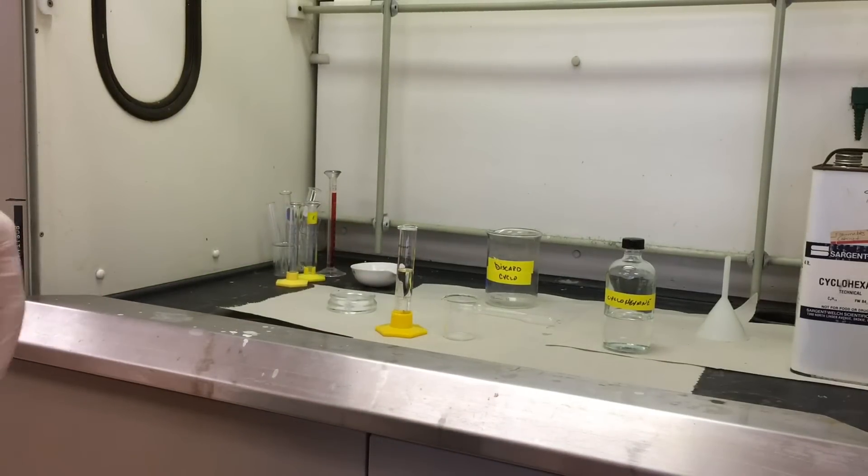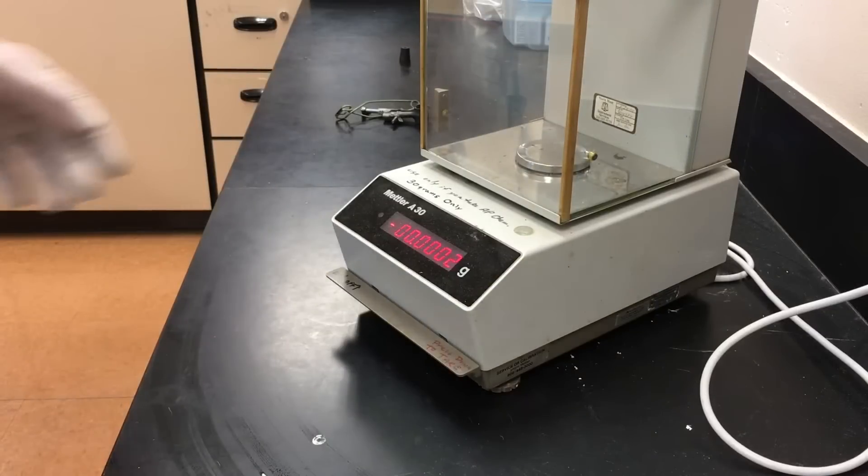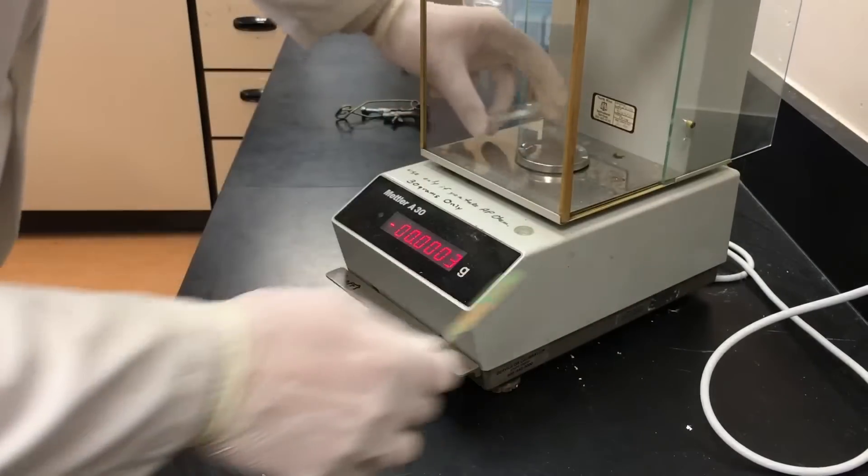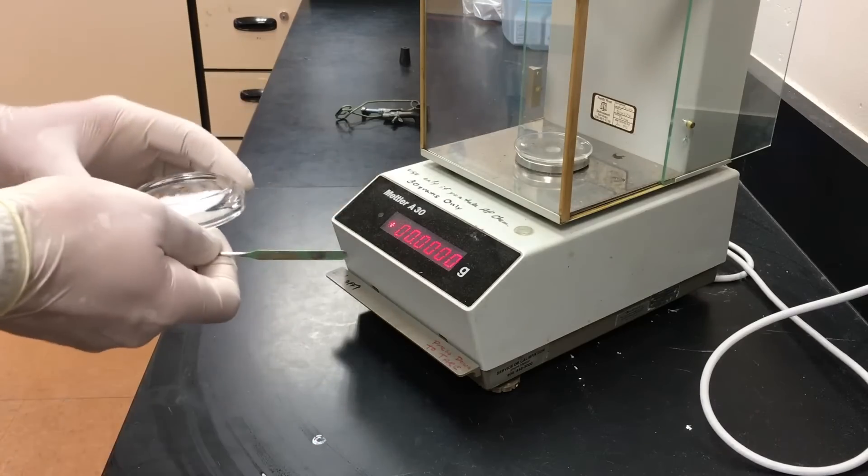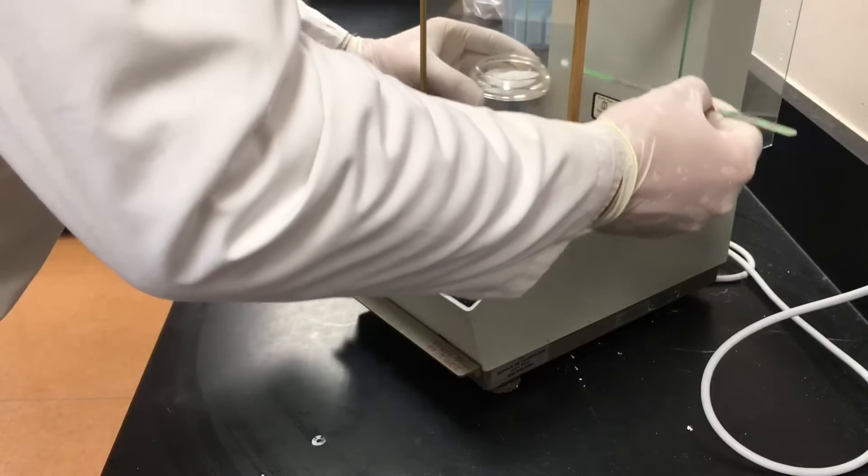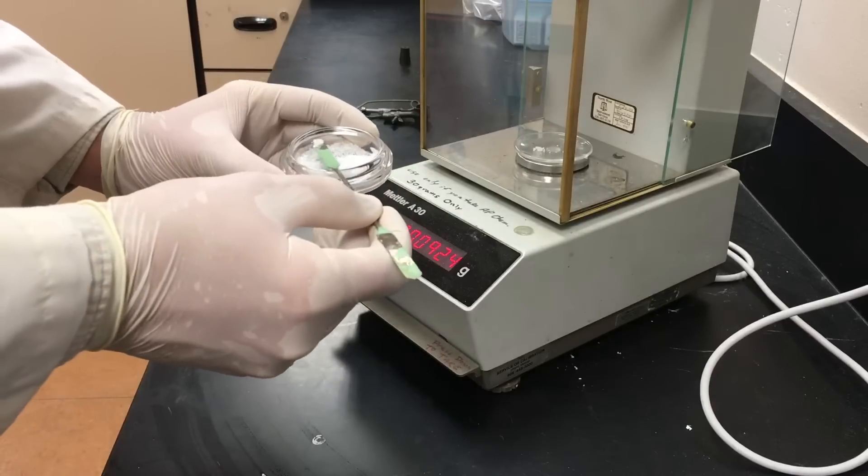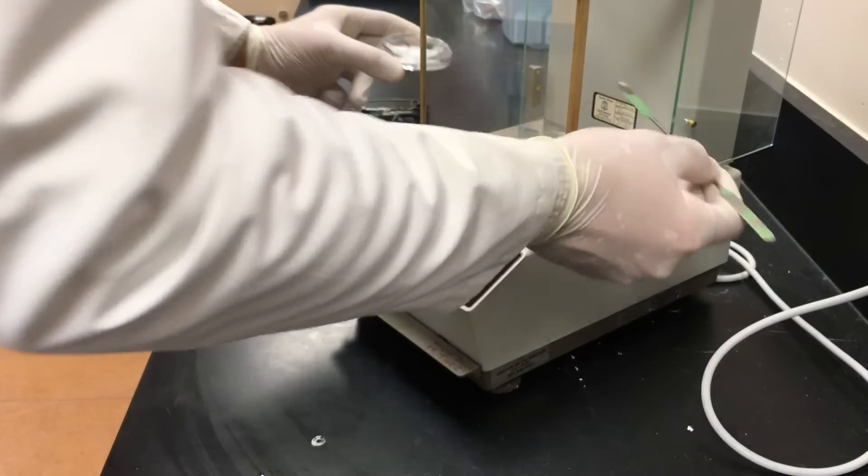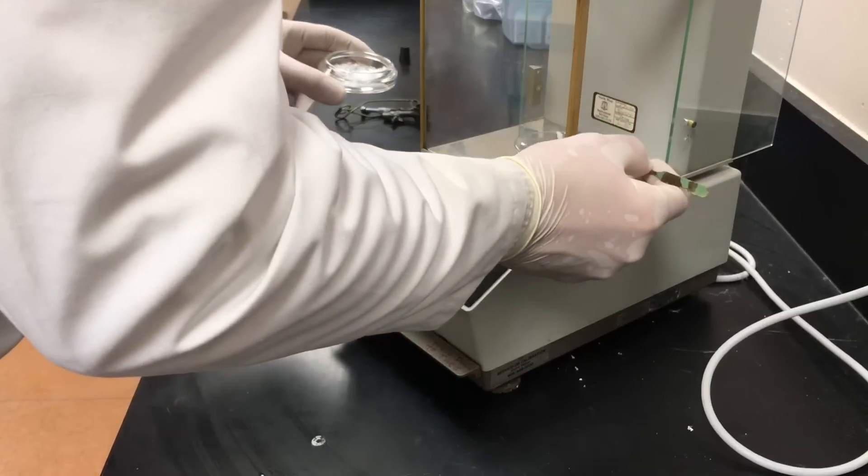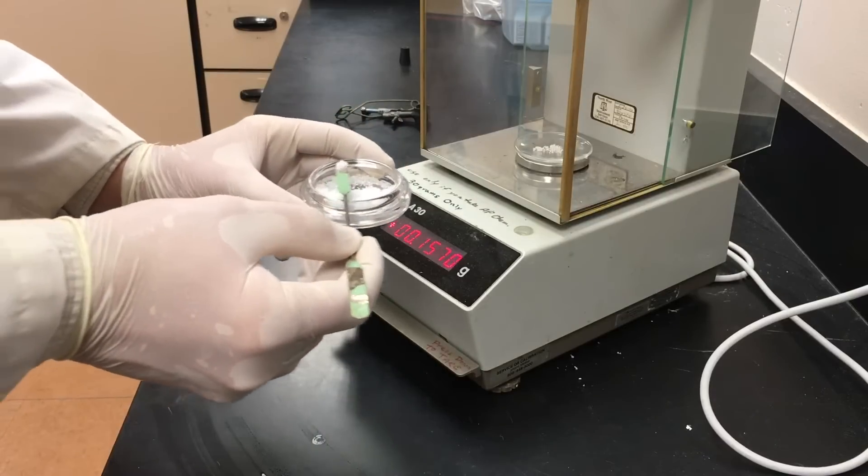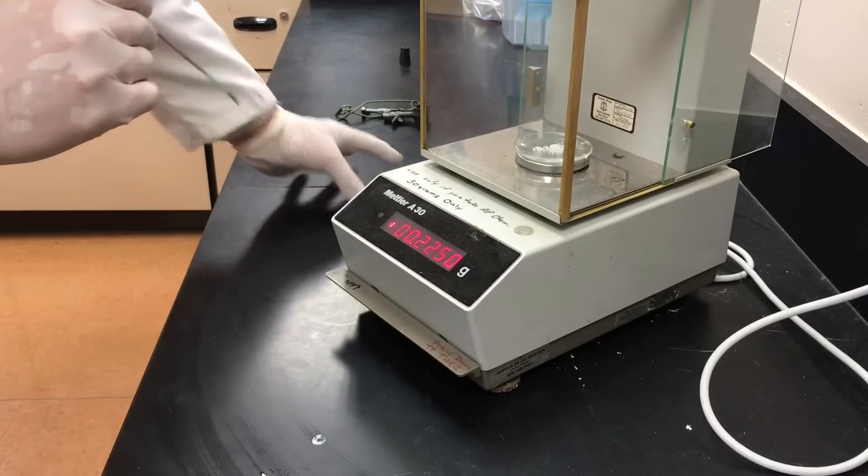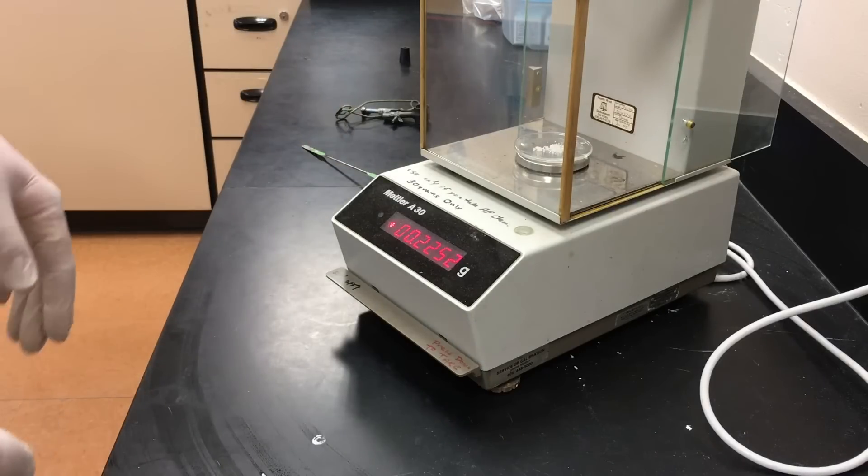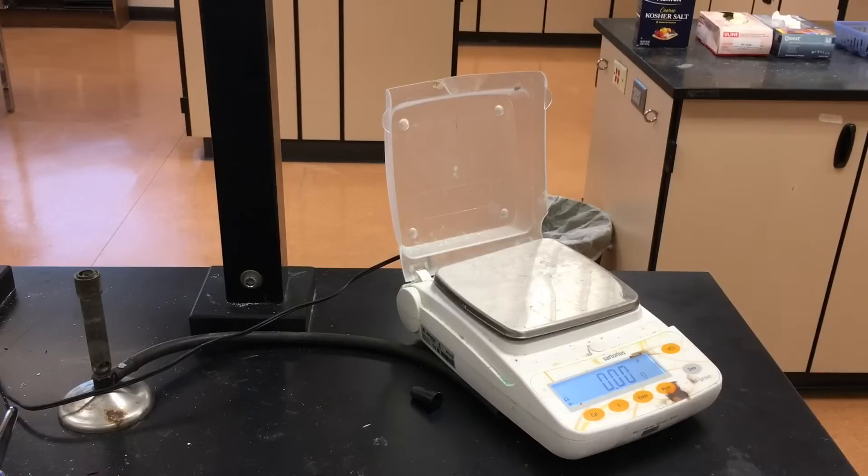Now measuring the mass of the unknown, we're gonna use the analytical scale. What we need to do is to measure about 0.2 to 0.3 grams of the unknown. We're gonna zero the scale. Anywhere from 0.2 to 0.3 is gonna give us a good temperature change, but not too much so that we're wasting the reagents. 0.2 to 0.52 or 0.50. We'll wait for it to settle so we know exactly how much unknown we have.